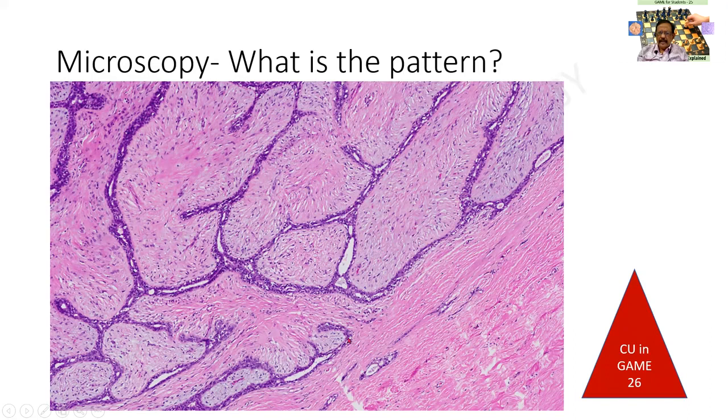Externally, I am finding a pseudocapsule. Because of this, it is a well-circumscribed mass, and the tumor can be scooped out by the surgeon by a process called enucleation. And this is just like removing the kernel from the coconut.